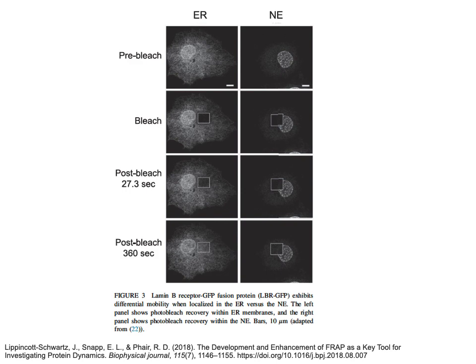So there's all these different fluorescent proteins, and a lot of them overlap in the wavelength that they get excited at and then emit. So you don't need 700 lasers, but 4 lasers starts to limit the number of fluorescent proteins or dyes you can use in your experiments. If you had 8, it's not just that you can look at 4 additional ones.